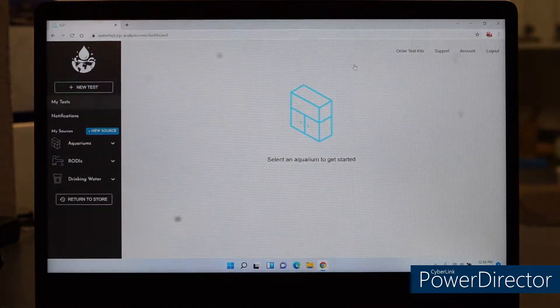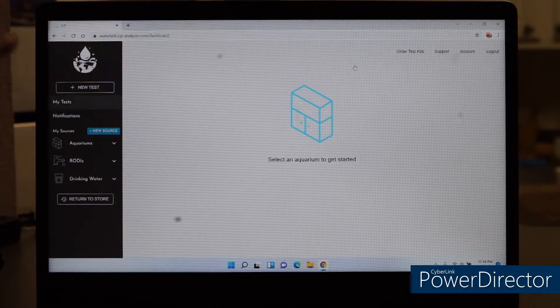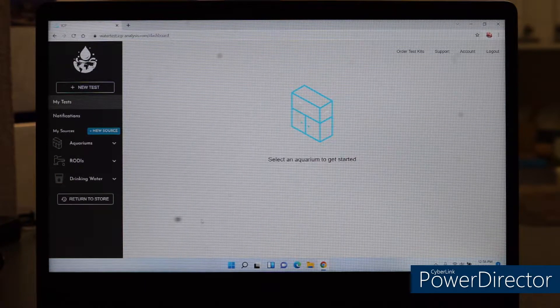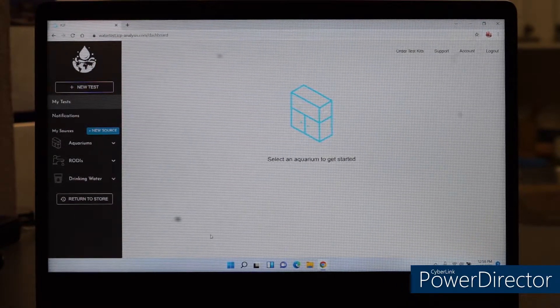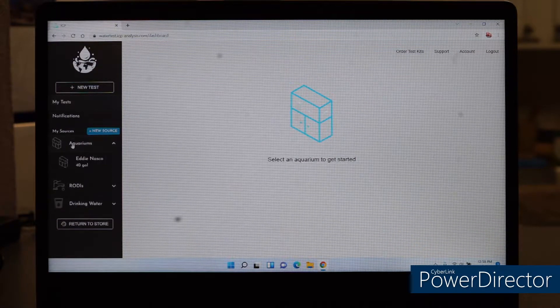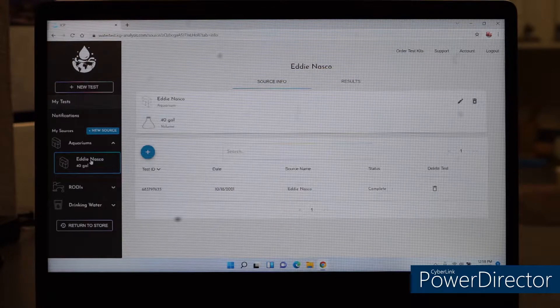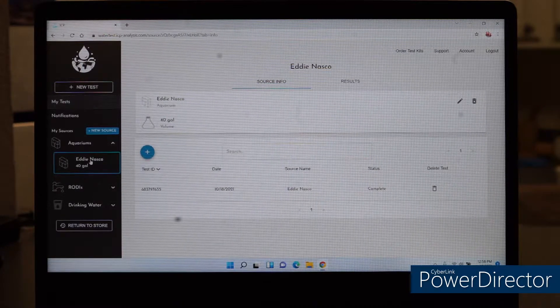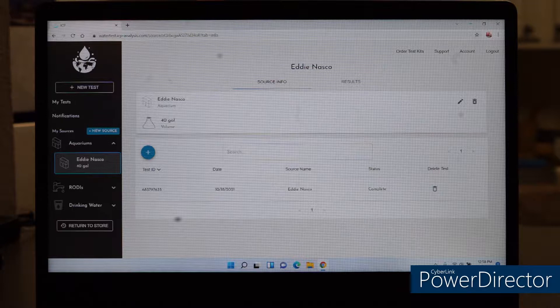Once you click 'Get My Results,' you'll get this screen. On the left side you have the aquarium and the RODI — you get two test tubes and you're supposed to test both your RODI water and your reef aquarium water. I'm good on the RODI. So you go to Aquariums, then click Eddie Nasco — that's my last name — 40 gallons. You'll see a main screen with a number assigned to you that you put on the test tube when you send it. Click that and you get the results.